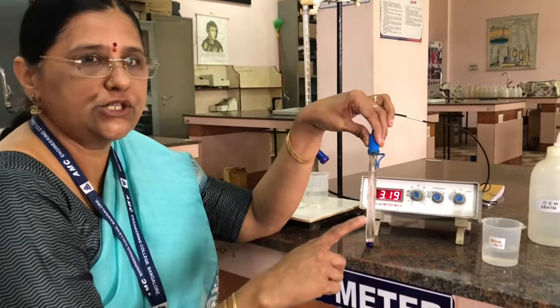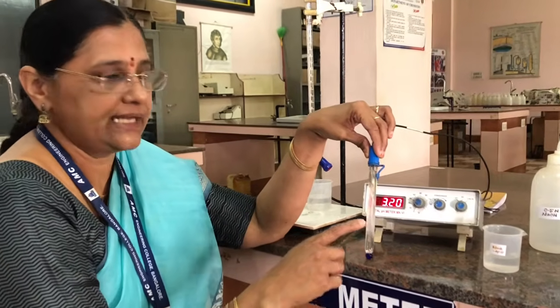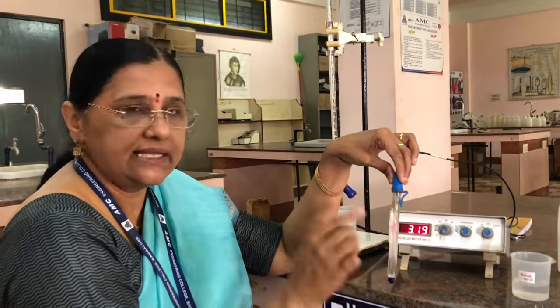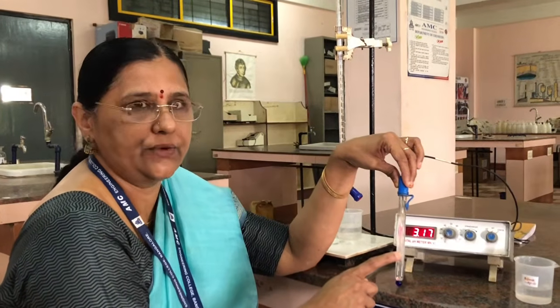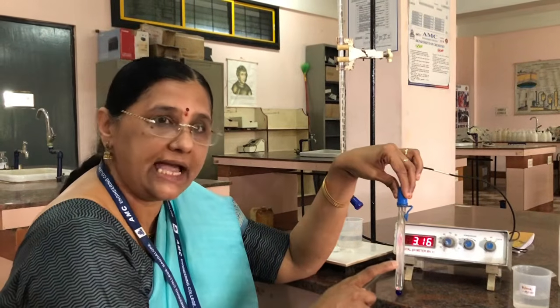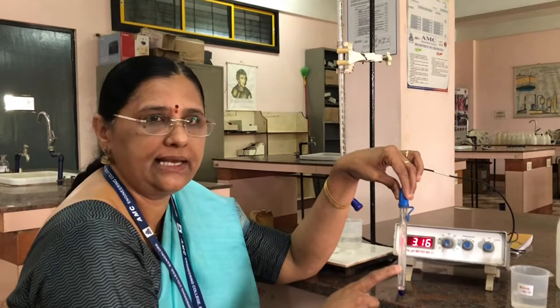That means it consists of a glass electrode and a calomel electrode inside, which are sealed inside a glass tube. In this, the glass electrode acts as an anode and the calomel electrode acts as a reference electrode. The glass electrode is also called an ion selective electrode, and also a membrane electrode.